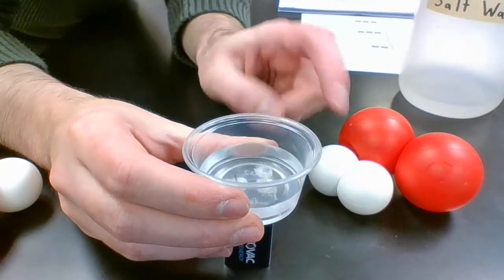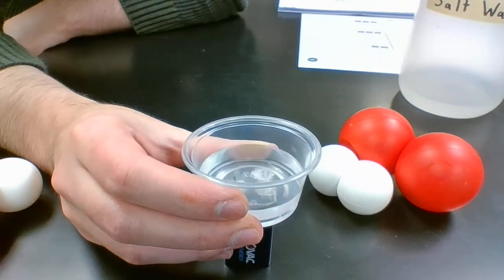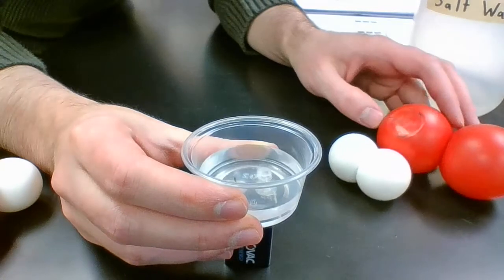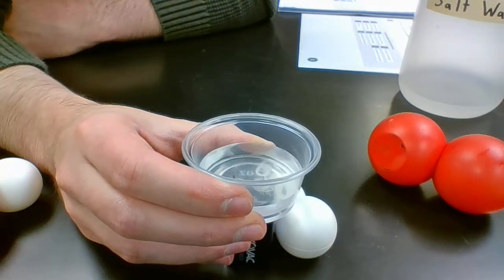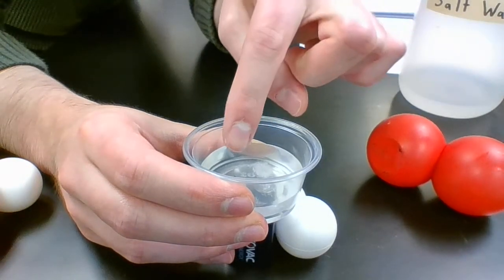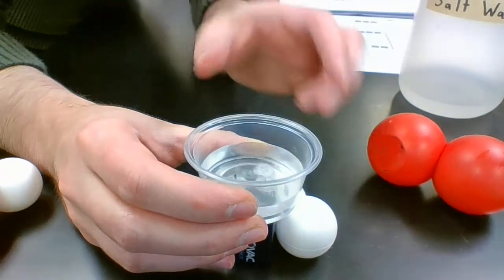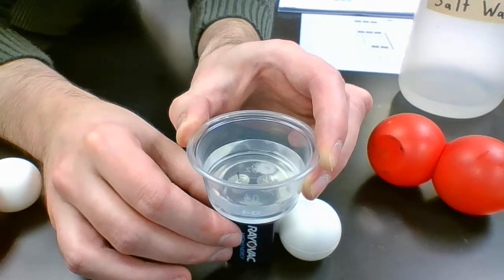So these bubbles are actually hydrogen gas. Now, the reaction tells us we should also get oxygen gas from this, but we don't see it. Well, if we are following the trend here, if we're getting hydrogen gas out here, maybe we're supposed to get oxygen gas out of this other tack, but so far it's not doing much.